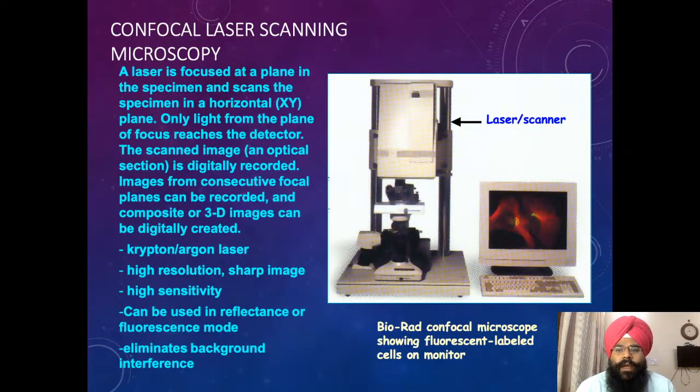Whenever you go to the lab, you will see either an inverted microscope, or a simple microscope attached to the computer, or a fluorescent, epifluorescent microscope, and confocal microscopes are also quite present. In my lab, when I was working in Germany, we had an inverted microscope and a fluorescent microscope attached to the computer, so we could take images and save them for later. We also had a confocal laser microscope, and an electron microscope, but we were not allowed to use it because it's very advanced, and we had very small experiments at that time.